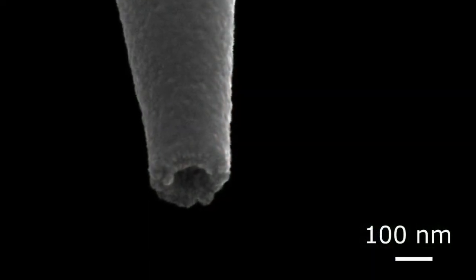To address this problem, we use scanning ion-conductance microscopy, a scanning probe microscopy technique capable of nanoscale resolution imaging of living cells using a sharp nanopipette as a scanning probe.